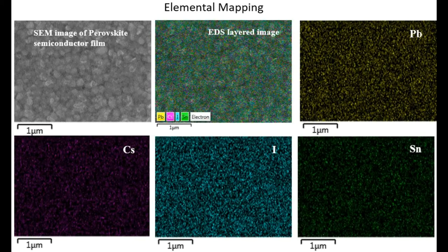Here you can see the distribution of different elements such as lead, cesium, iodide, tin in a perovskite film identified by the different color codes.